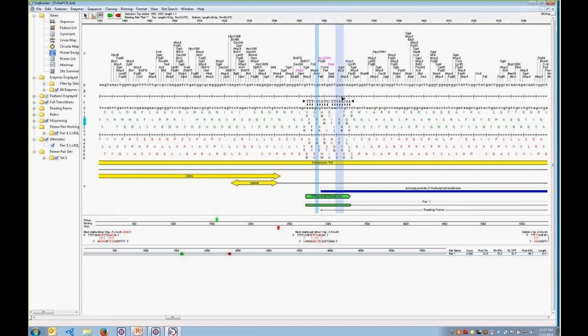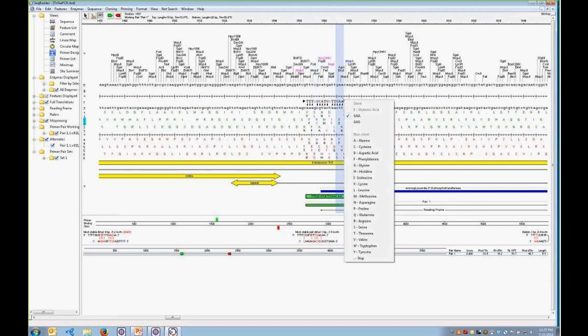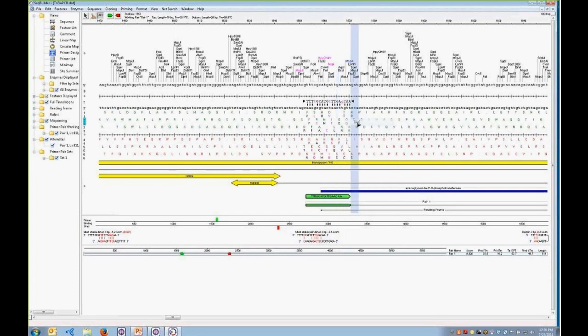When we click on a codon that we'd like to adjust, a menu opens up that allows us to either select a list of alternate codons available for silent mutations or non-silent mutations. So we can go ahead and, in this case, introduce a silent mutation. As you can see, the change shows up in magenta for all aspects.